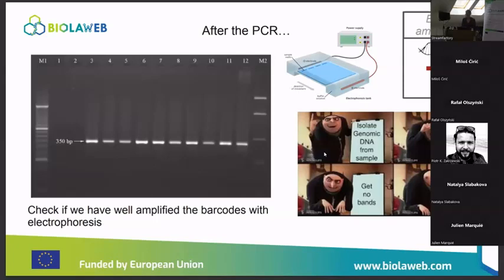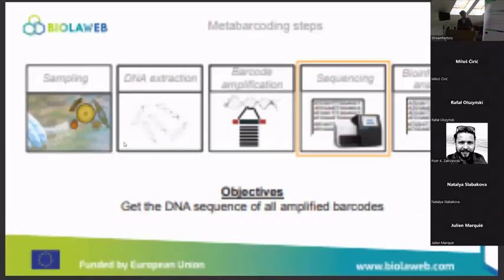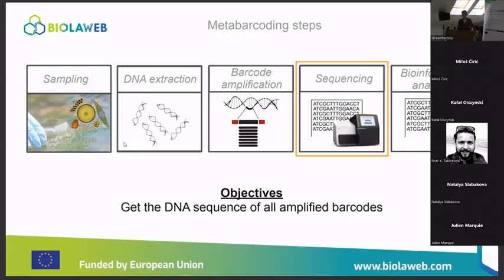And then to check if your PCR worked well, you use this electrophoresis I explained before, and now you expect to have only a signal at a certain length, the amplicon size. So if you have any questions on these steps.